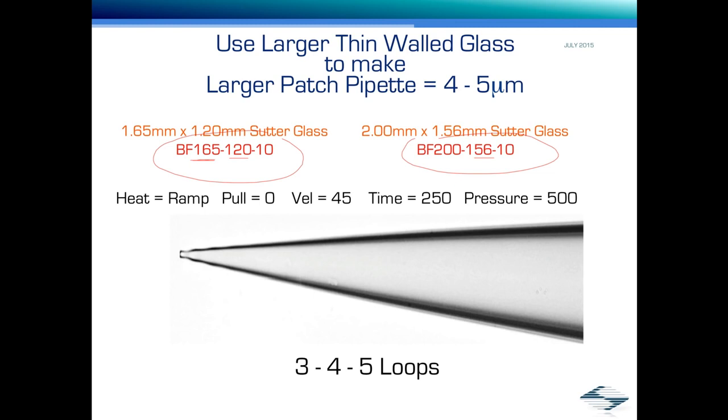Very well. Okay. Just again, another loop question. We have a program that pulls an inconsistent number of loops. Is there a way to prevent this?